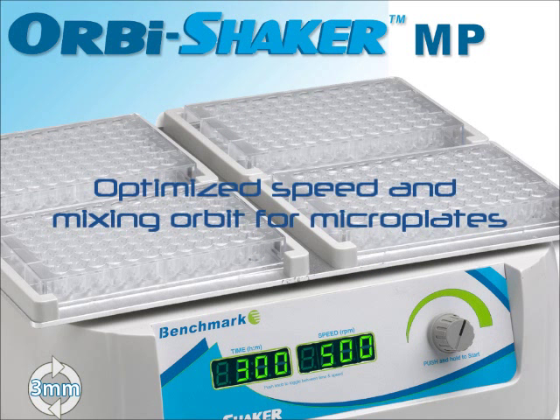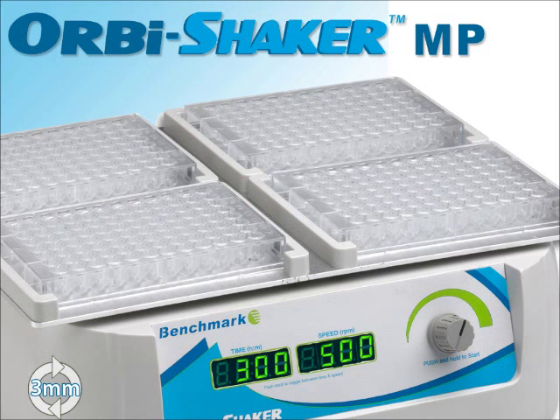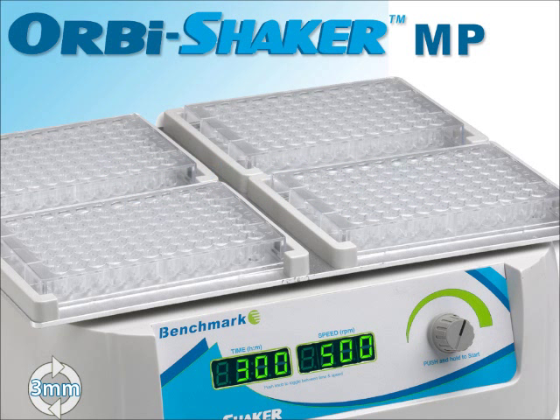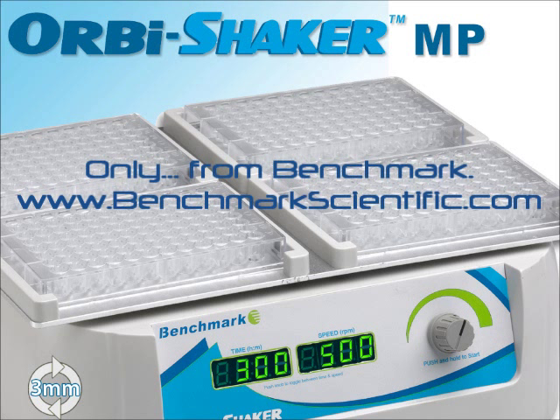The Orbi Shaker MP simplifies sample mixing in nearly every microplate format. For more information on the Orbi Shaker MP or any Benchmark product, visit www.benchmarkscientific.com.